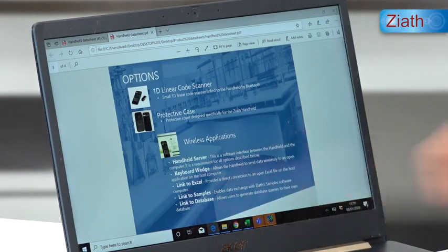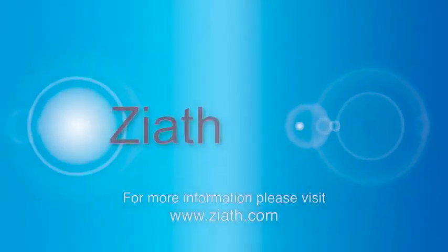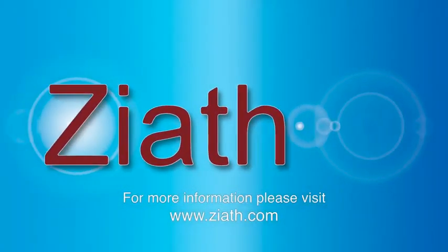Link to Database allows the handheld to wirelessly communicate with your database. The handheld can be taken anywhere on site, a tube can be scanned, and the sample information will be displayed on the handheld screen. For more information about the handheld device, please visit www.ziath.com.